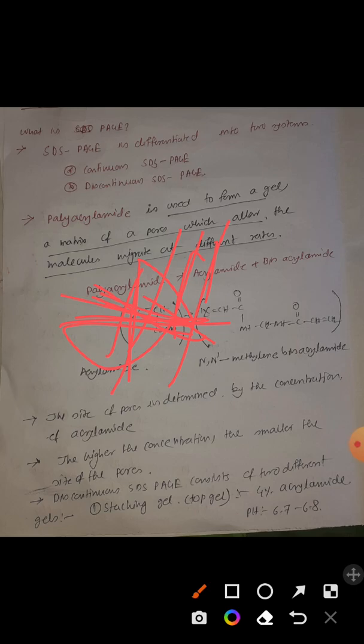But if your protein is intact, in that case you have to lower your acrylamide concentration so that it gives you a larger pore, so that you can easily separate them. That is the idea. We have to set the gel concentration on the basis of our requirement, whether we are dealing with delicate particles or relatively larger particles.